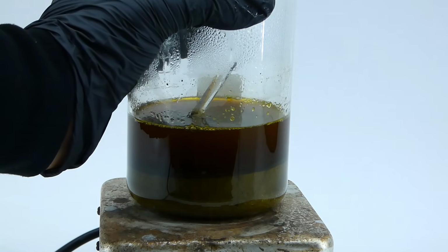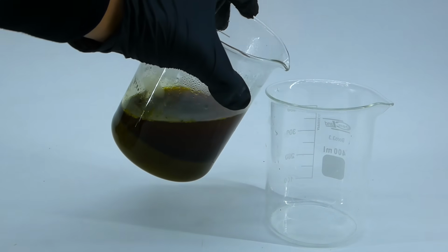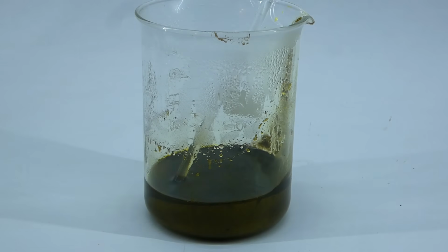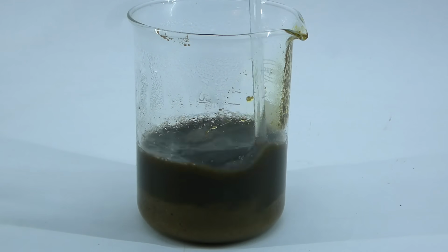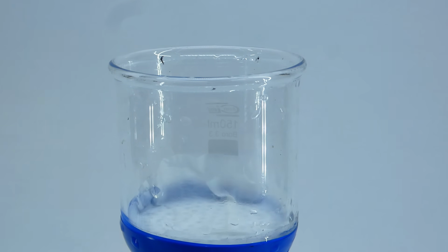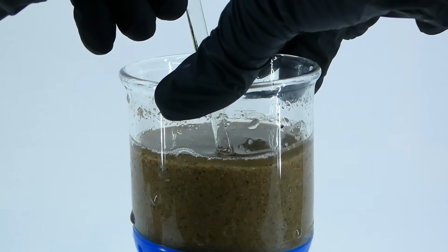After about 30 minutes of refluxing, I took the beaker off the heat, decanted most of the acid, and poured in a lot of distilled water to dilute the rest. The sand was now much clearer and had a grey color. I then vacuum filtered it to wash away the last bits of the acid and got it into an oven to dry, because for the next step it needs to be really dry.